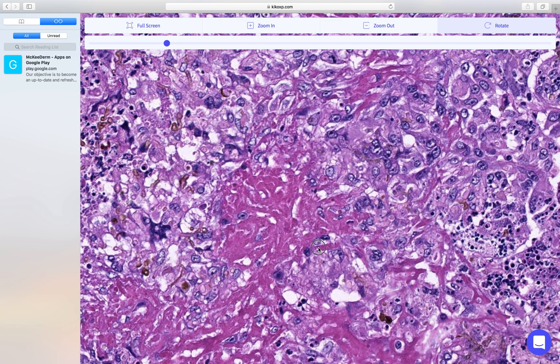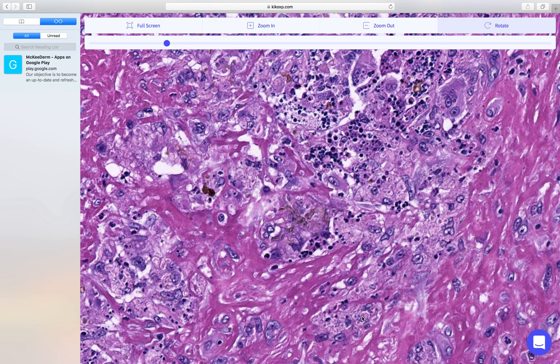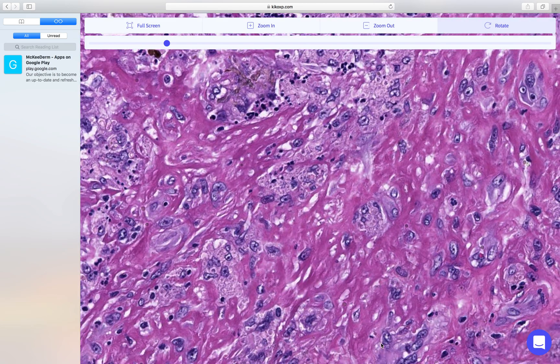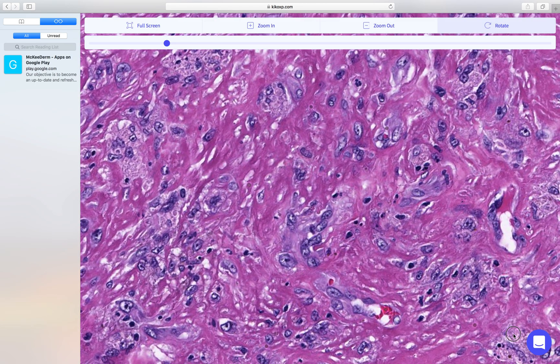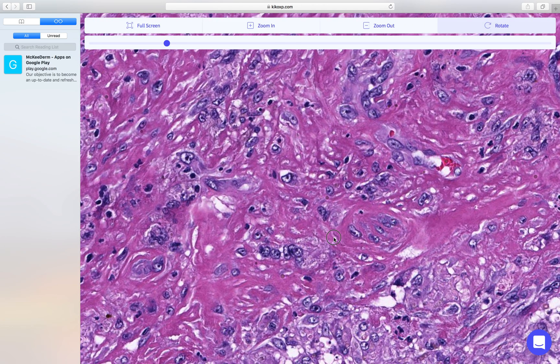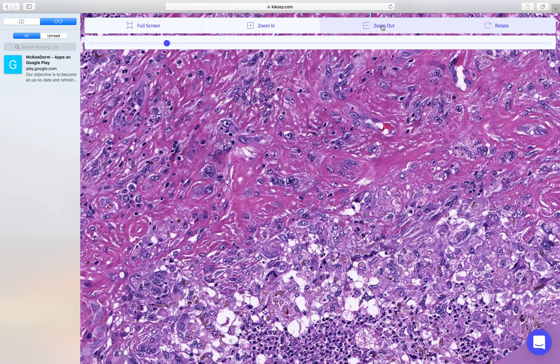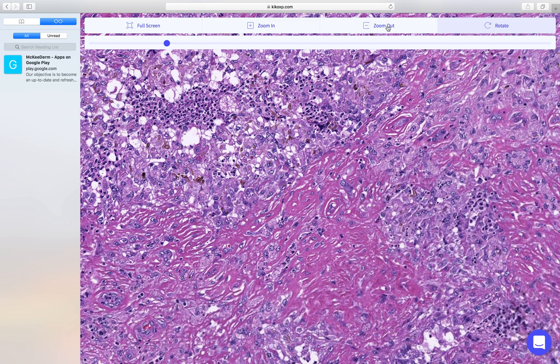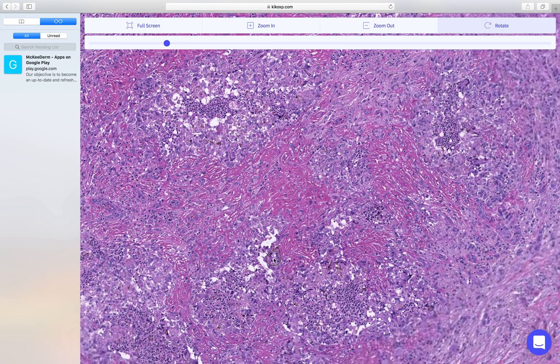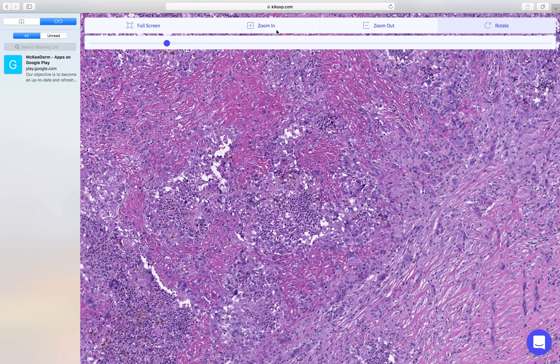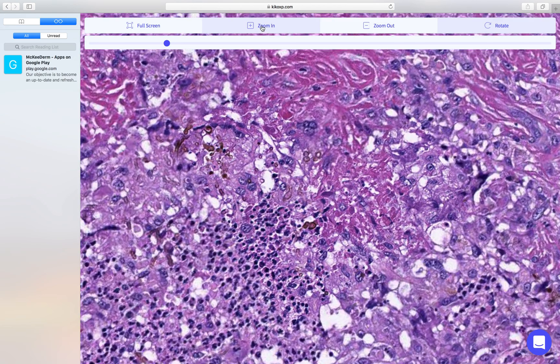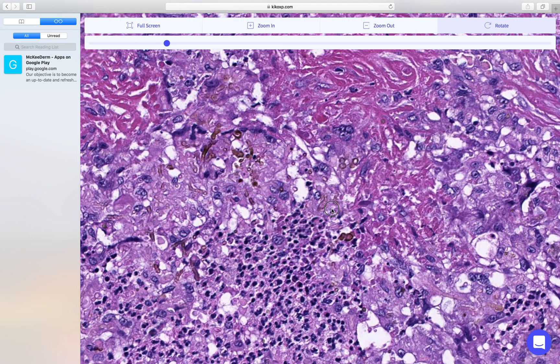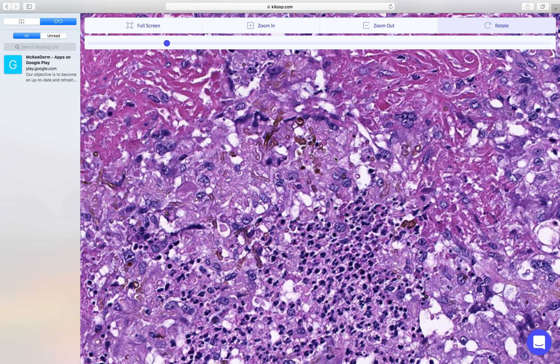Moving around the slide to see what else we can pick up, there are more organisms there. I'll reduce the magnification a little because I know there are areas where there are just numerous hyphae. And — wow — there they are: heavily pigmented hyphae and yeast forms. This is pretty much diagnostic of pheohyphomycosis.